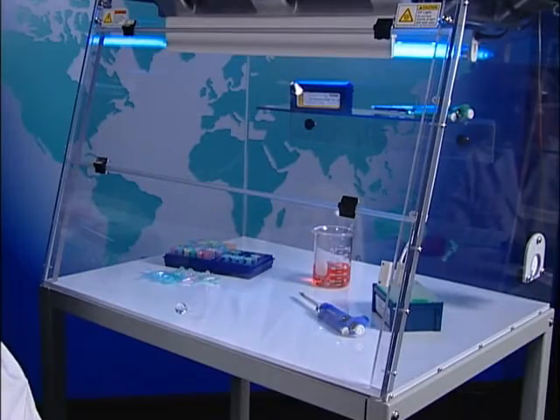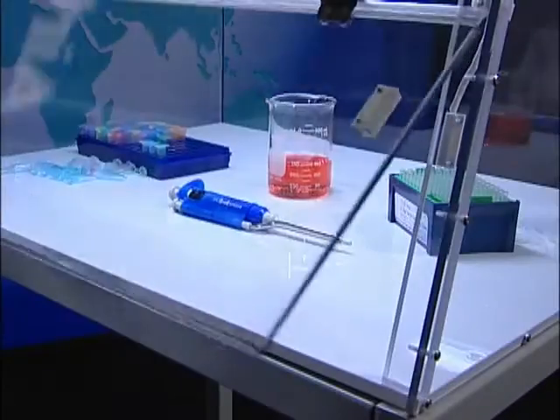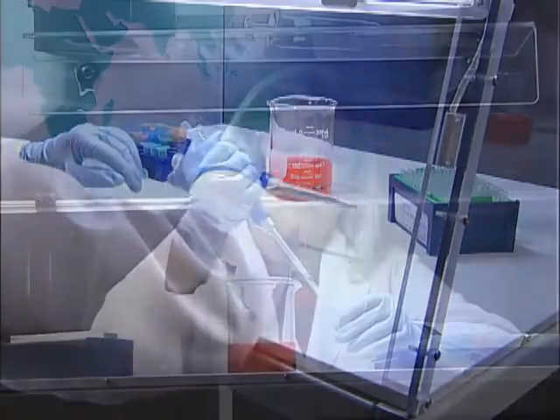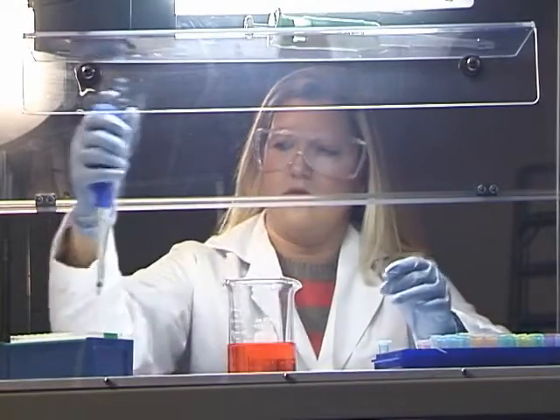If the sash is opened while the UV bulb is illuminated, UV tech automatically turns the UV bulb off and turns the blower and the fluorescent light back on to create the ideal work area for amplification of DNA and RNA.